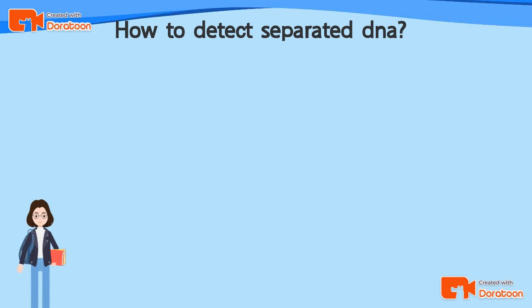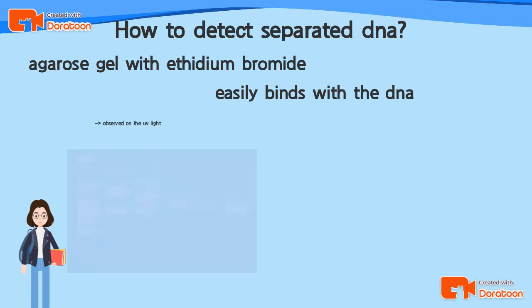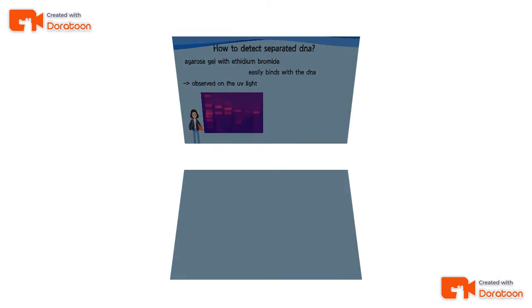After we get the result, how do we detect the separated DNA? We observe the DNA molecules by treating the agarose gel with ethidium bromide. We use ethidium bromide because it easily binds with DNA molecules. When the agarose gel containing DNA is observed under UV light, light orange colored bands will appear, and those are called DNA bands.